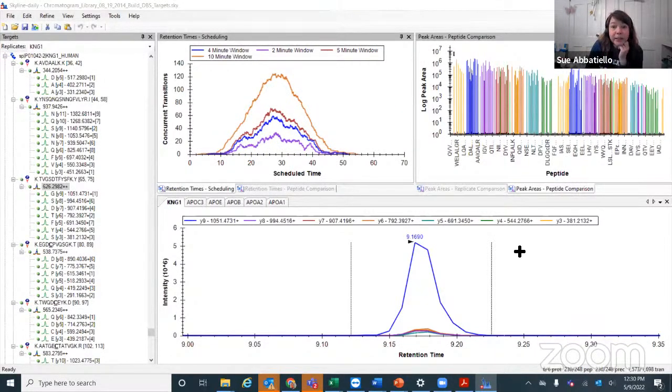The most significant increase in sensitivity is often lowering the flow rate and moving to very small chromatographic diameter beads, or longer columns that will improve your chromatographic resolution, or using orthogonal approaches like ion mobility or FAIMS, which usually increases the signal to noise for MRM.